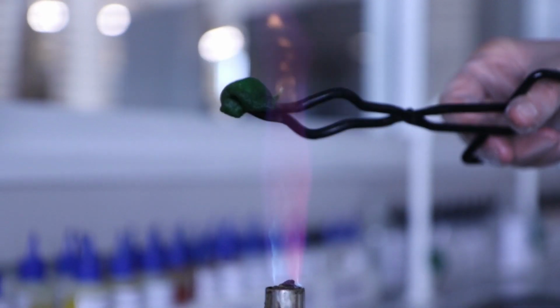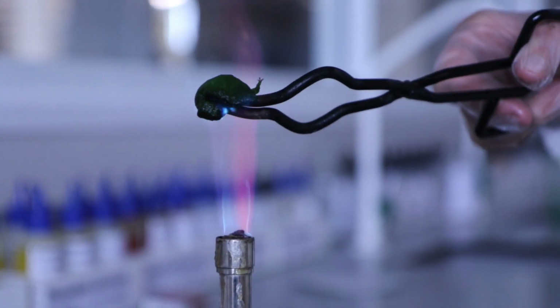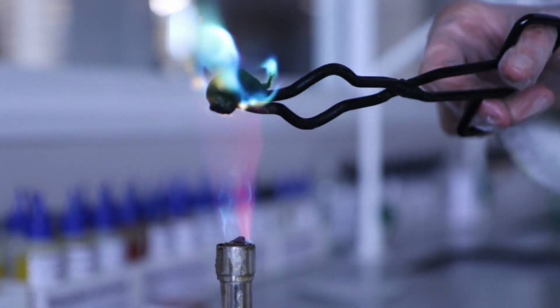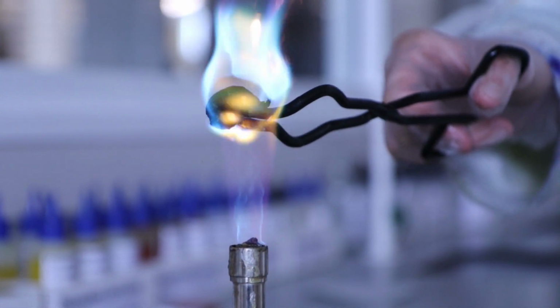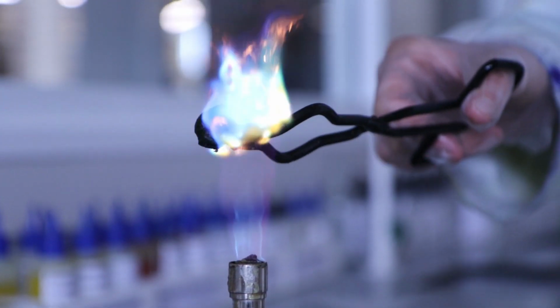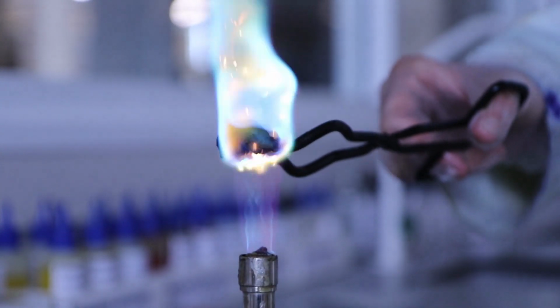Time for copper chloride. You can see here it burns like a greeny blue. It kind of depends on the heat, or how much energy you're putting into those electrons and how far they have to move. So yeah, that's cool. You can hear a cool fizzing sound. Generally, the bigger the nucleus, the more electrons, therefore you generally have a higher electron level. It's only really the valence electrons that generally move. Probably should point that out.